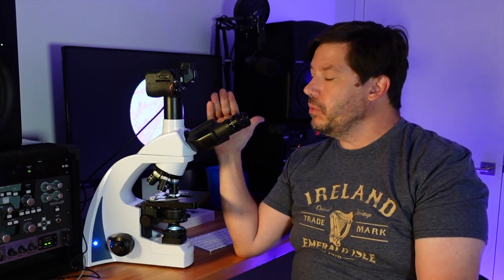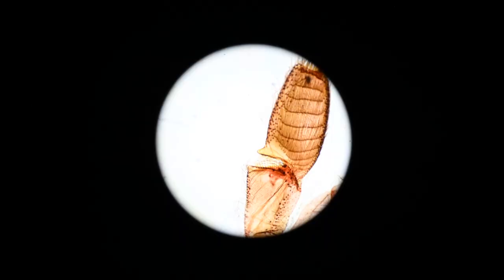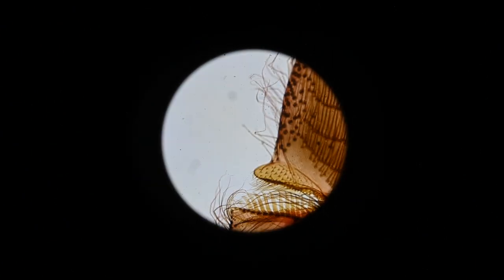Now of course a huge question here is: is this parfocal? Am I going to be able to look through the ocular lenses of the scope and see a nice clear image, and simultaneously see a nice clear image on the screen? The answer is generally yes. Under the 4x lens I'd say I have to give the fine focus about a full turn, which is a little more than I usually expect, but when I get up to the higher objectives I barely have to move the focus knob at all.